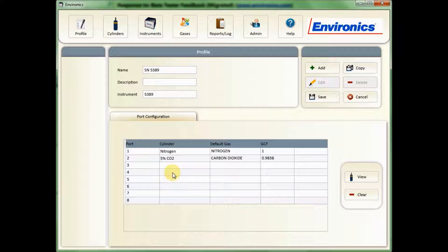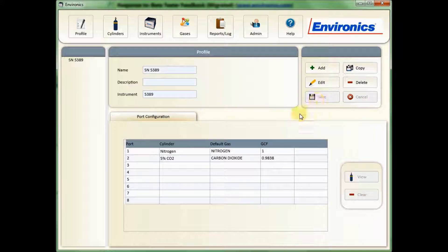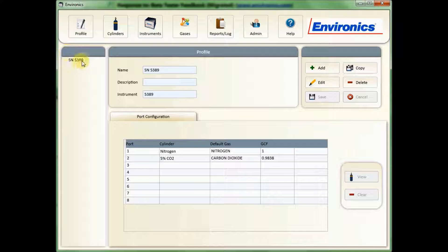Once that's done, click on Save. You can see now my serial number is coming up on the left-hand side showing that the profile has been created.